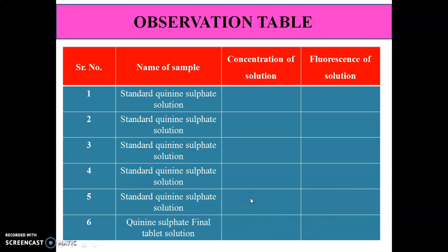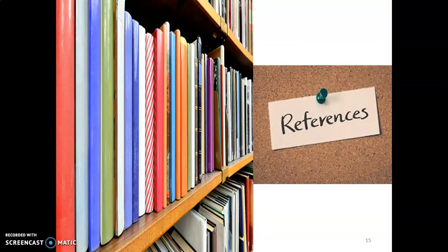And then find out the concentration of the quinine sulphate final tablet solution from the calibration curve. Then you have to write down the results and conclusion.